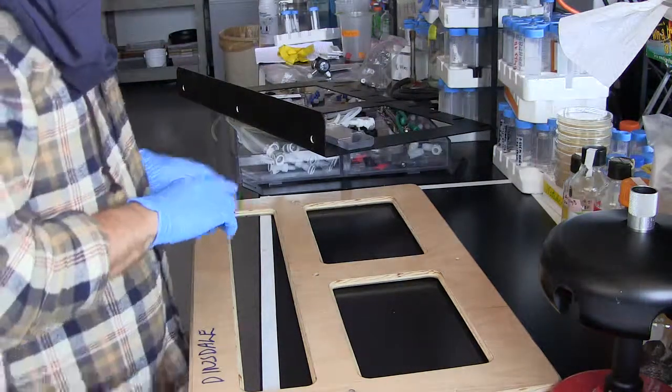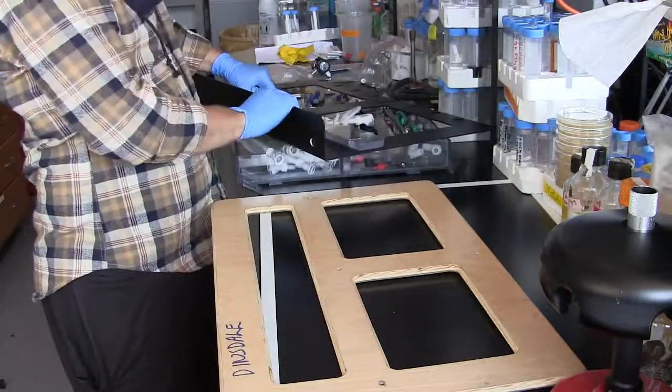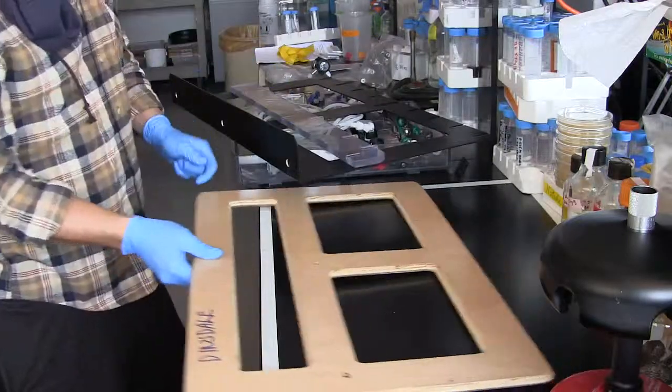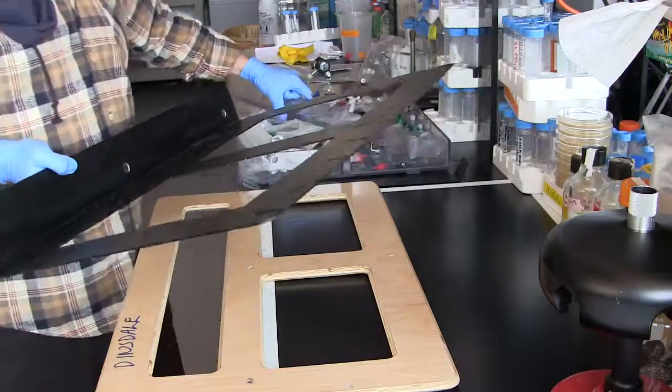Hello. Okay, we're going to put it together. We have our base plate here, we have the thing the Niskins rest on, and then we have the back plate here. Okay, what we have to do is line everything up like this.